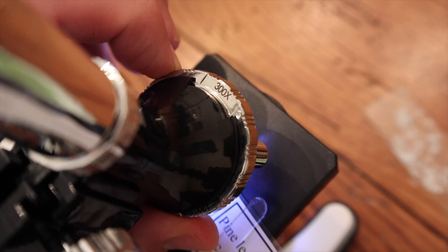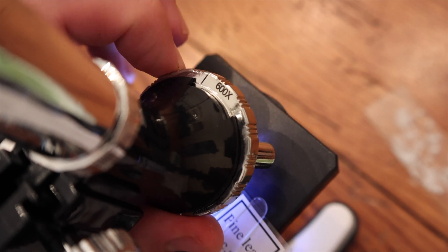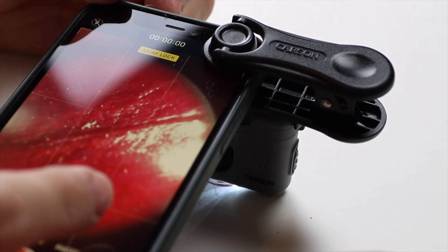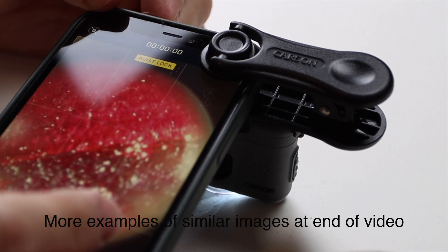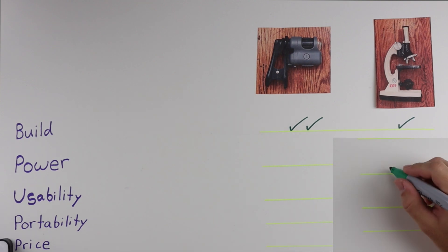Next we're talking about power or magnification, and in this category we have a clear winner. The lowest magnification the Amscope provides is still higher than anything the Carson Micro Mini offers, and it can get up to 2,400 times magnification — though image quality at that level is a little suspect. Don't let the 20 times magnification fool you though; as we showed in a previous video, you can use the Carson coupled with your cell phone and actually visualize the cells of an onion's skin, which is still pretty impressive. Just think about how much magnification you really need. The Amscope clearly takes the prize in this category.